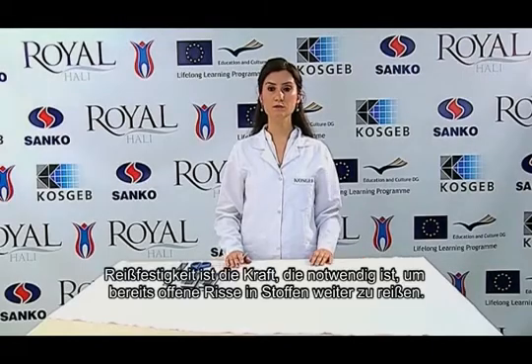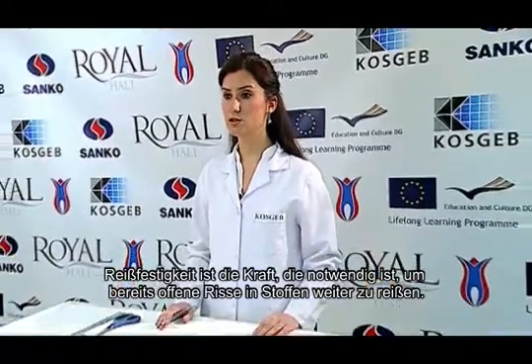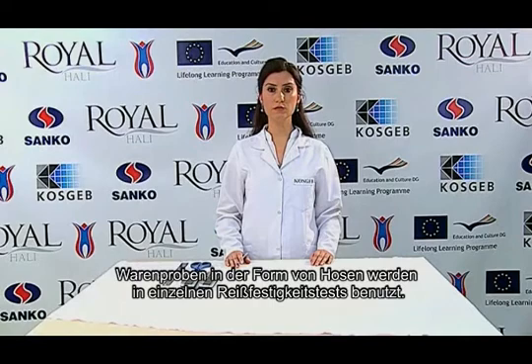Hello friends. The tear strength is the strength necessary for the advancement of a previously opened tear in fabrics. The test samples prepared in the form of trousers are used in a single tear strength test.